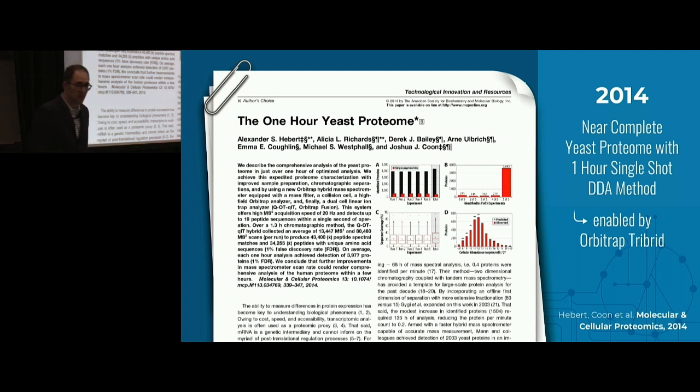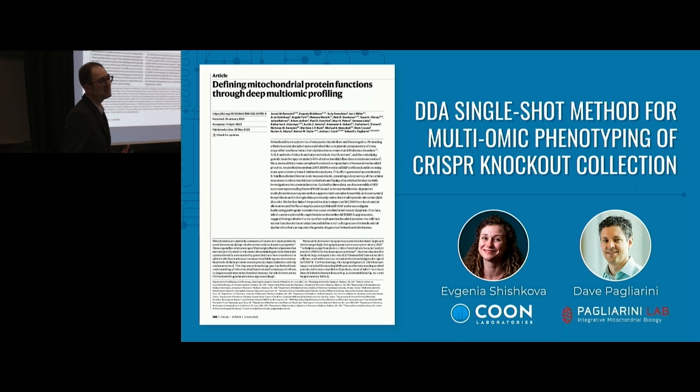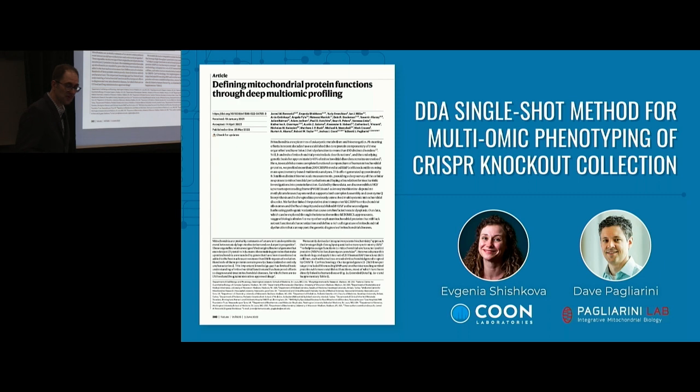And so we've been thinking in that way for quite a while. More recently, we used basically that same approach on relatively newer generations of the Tribrid, with the same kind of acquisition strategy, to do human cell lysates. In this case, I'll just walk you through to give you some comparison to where we're coming from.